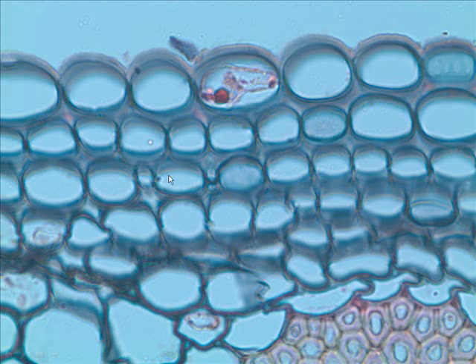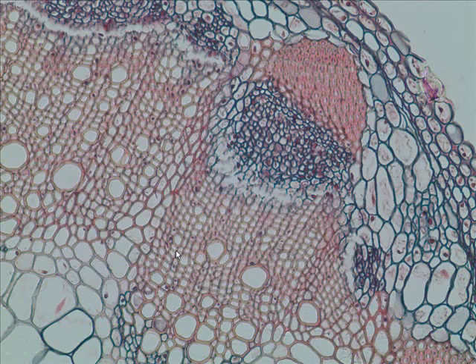All right, here we are right up at the very edge. This would be epidermis. What would this tissue be just inside the epidermis? Collenchyma. What does it provide for this herbaceous plant stem? It provides flexible support, absolutely. Now we're looking at an actual vascular bundle. What is this again? It is sclerenchyma. What's this? Phloem, primary phloem. And what is this? Primary xylem.